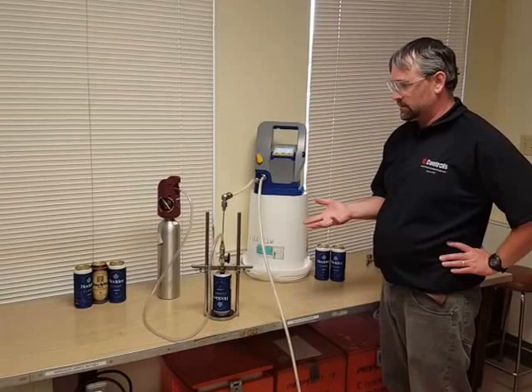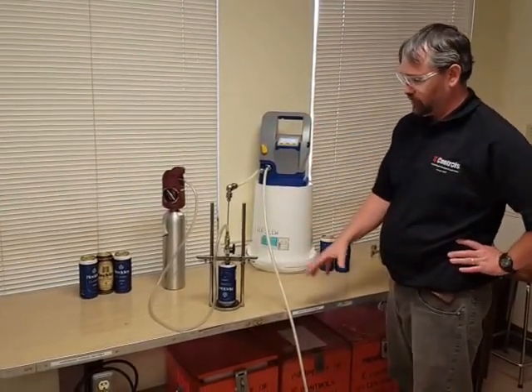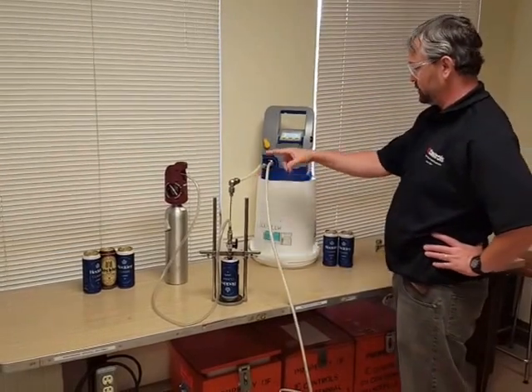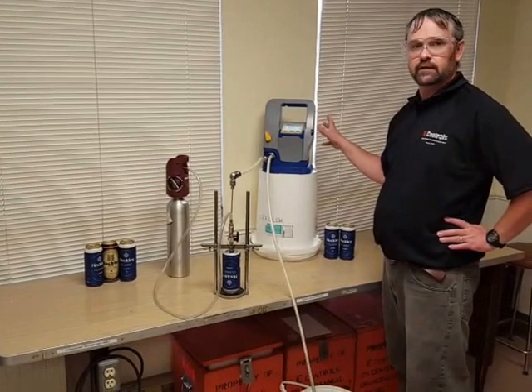In order to get accurate results, you want to use a few burner cans. In other words, you're going to prime the system by putting a can or two through, which will purge any air that is already in there from previous use.